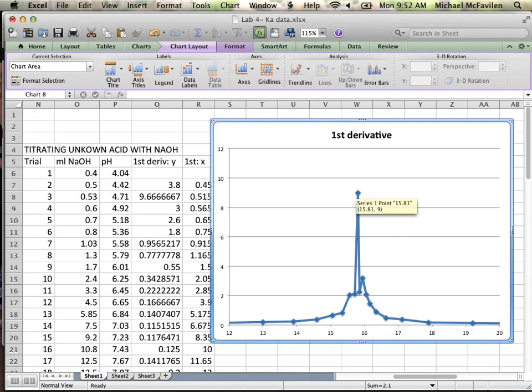Okay. The next part of this is saying, okay, we're again just kind of guessing approximately where it is. So we want a more definitive value. Okay, so let's go back to our first derivative curve and say, okay, we're trying to get that peak. What can you tell me about that peak? So let's go through and draw a curve in on top of this.